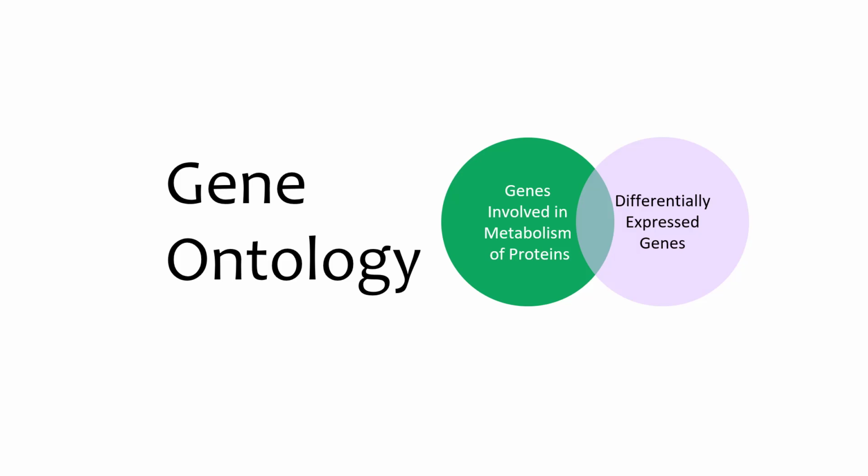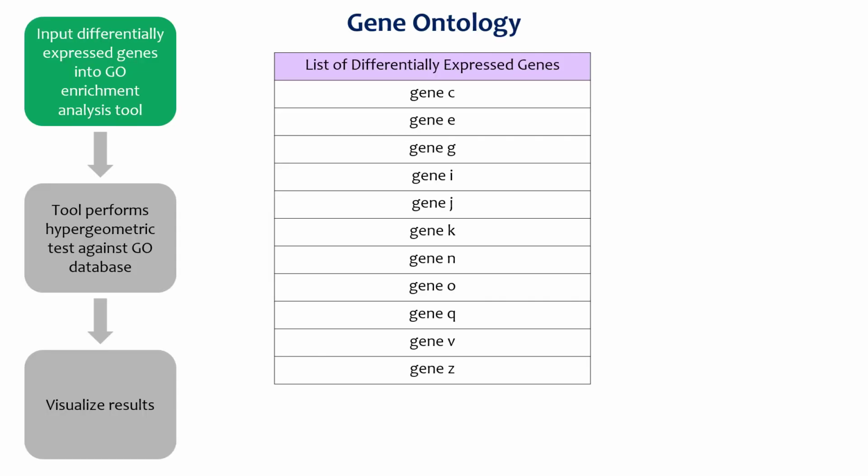Researchers use a bioinformatics approach called gene ontology to address the following question: which cellular processes are showing up as being particularly relevant in the analysis under study? Gene ontology helps to connect differentially or circadian expressed genes to a phenotype from a bottom-up approach. The general workflow of gene ontology is as follows.